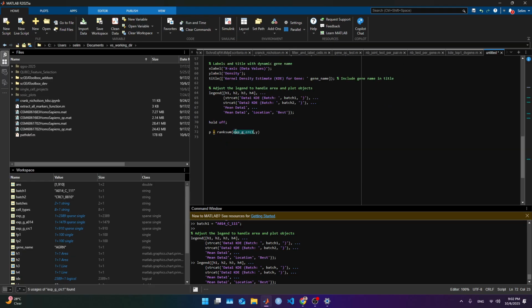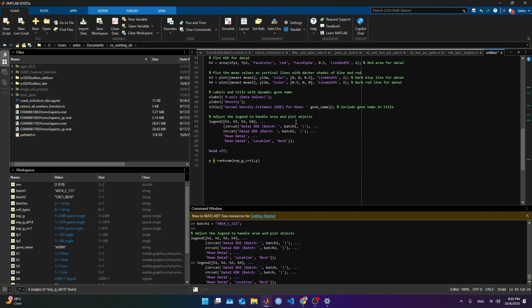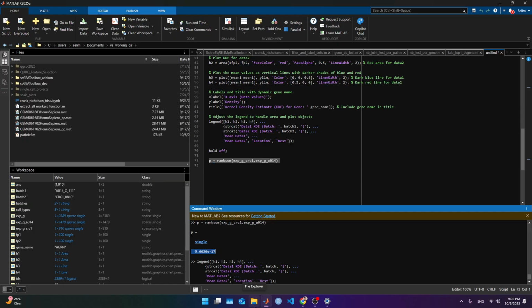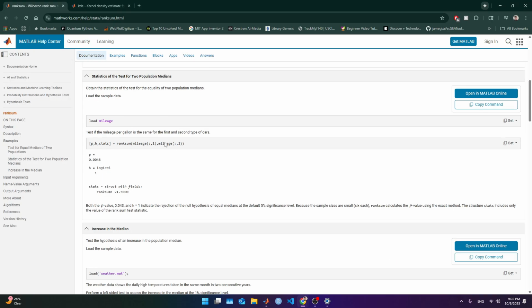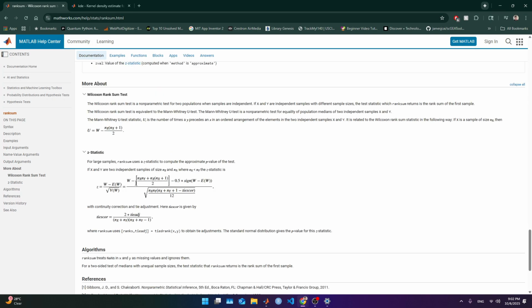It doesn't matter which one is first. Well, it matters to tell upregulated, downregulated. But since we know what we have, we know which one has the direction. We run the Wilcoxon, and that's it. It says this much. If we look at the differential expression file, it should have a similar value. It's significantly different. That's it. What the ranked sum is, it sorts the values, right?